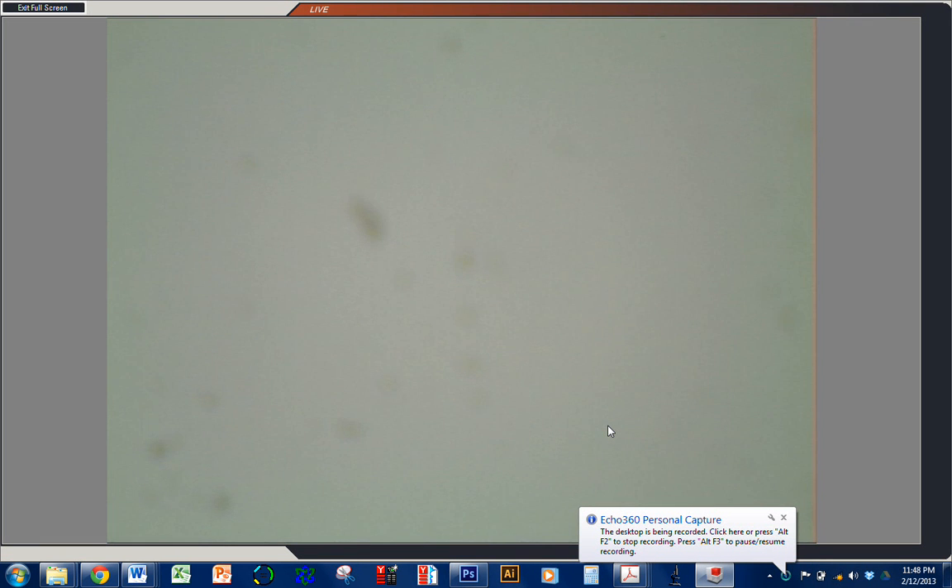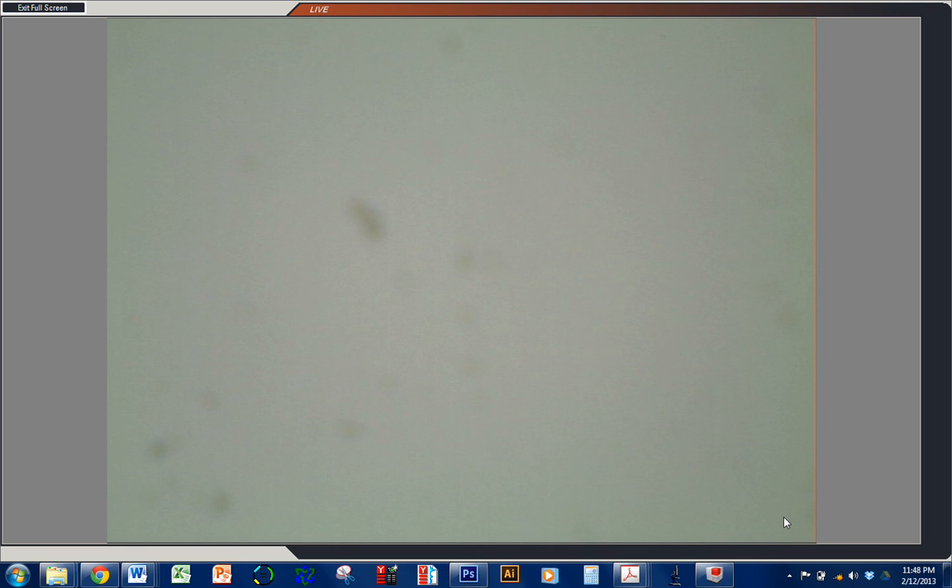This is Scott Ferguson at SUNY Fredonia. I'm going to teach you today how to dissect ovaries from female Drosophila. In this case we're going to use them for immunoblotting — we're looking for a protein in the ovaries, and in order to do that all we have to do is get them out of the fly and grind them up in lysis buffer.